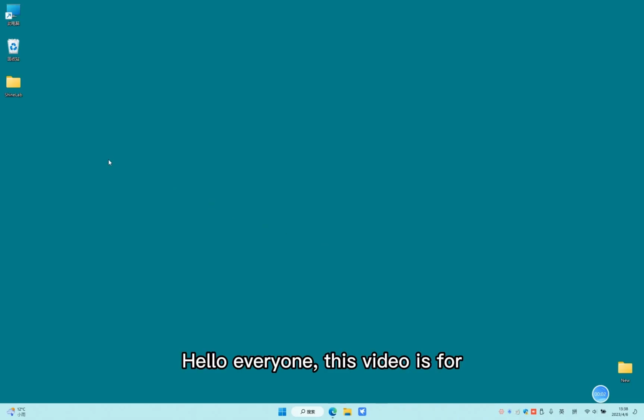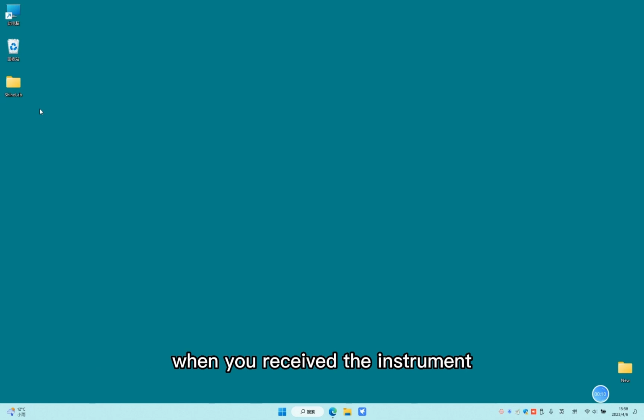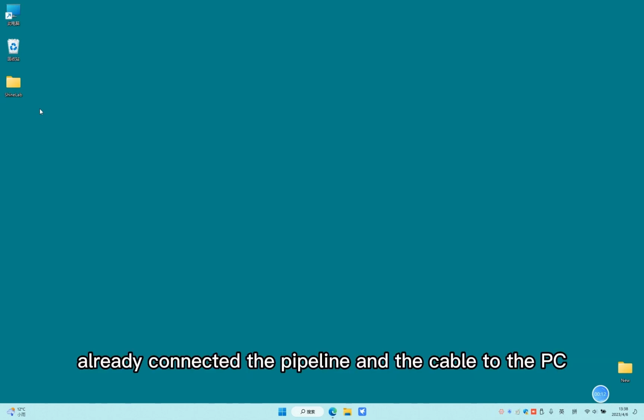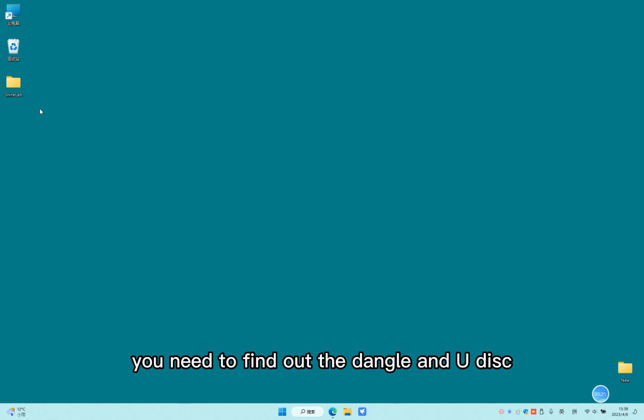Everyone, this video is to guide you on how to install the ShineLab software and use it. When you receive the instrument, the pipeline and the cable to the PC are already connected, and the next step is to install the software. You need to find the dongle and the U-disk.